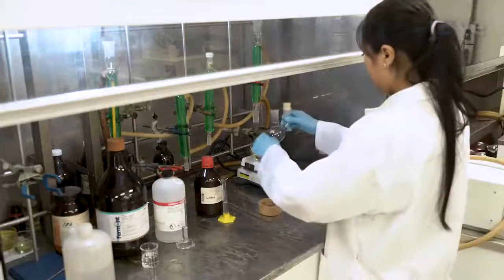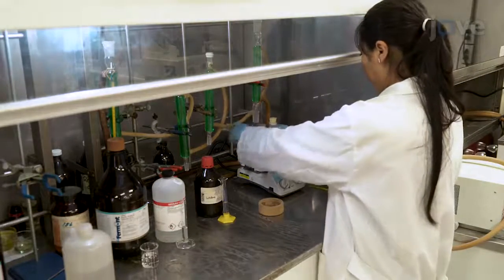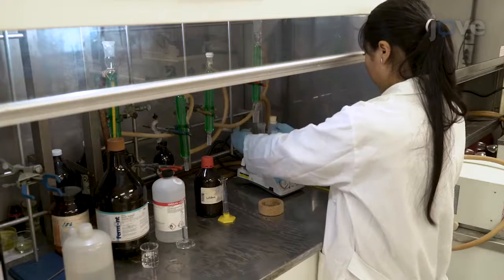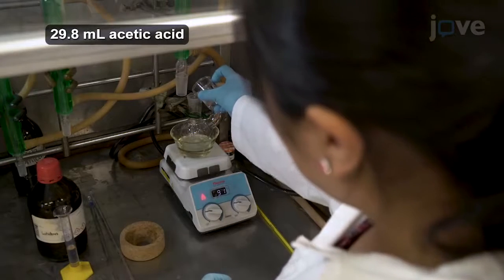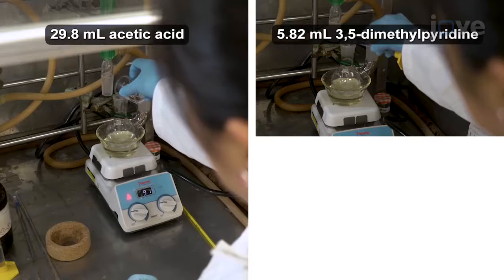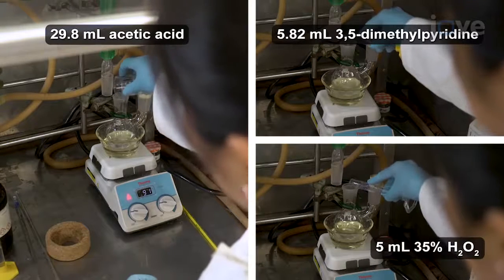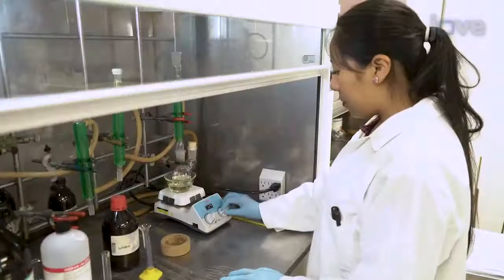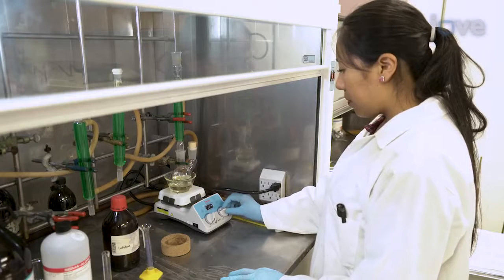First, place an open 100 milliliter round-bottom flask containing a magnetic stir bar on a magnetic stir plate in a fume hood. Add 29.8 milliliters of glacial acetic acid, 5.82 milliliters of 3,5-dimethylpyridine, and 5 milliliters of 35% hydrogen peroxide to the flask. Stir the reaction mixture at an inner temperature of 80 degrees Celsius for 5 hours.